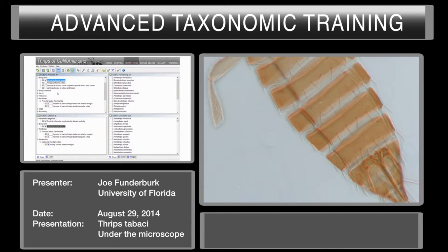I might also point out — since I know what this species is in advance — that this particular species has a yellow form. It should not matter in the key if your particular specimen is almost uniformly yellow; if you happen to choose that, it should not discard the species.